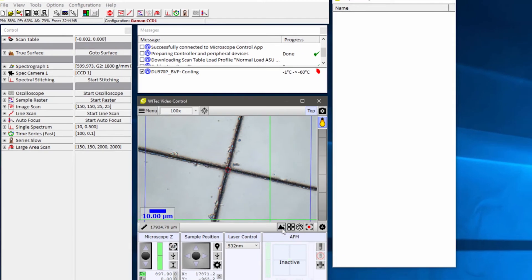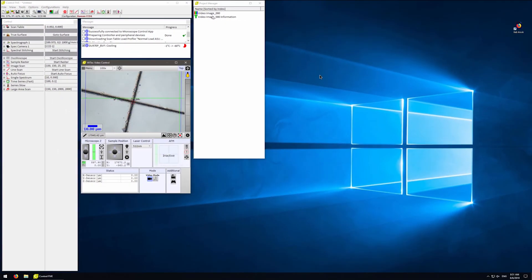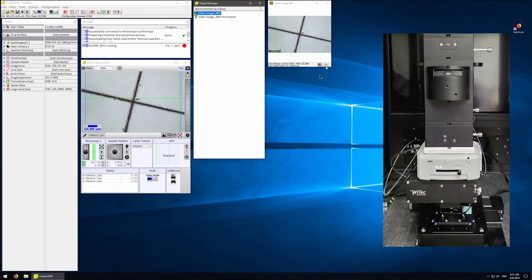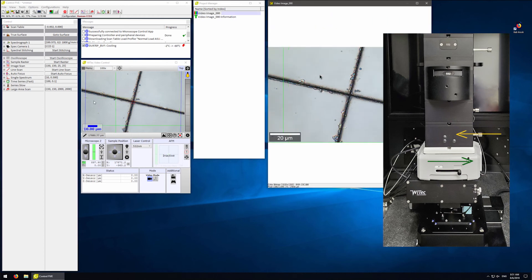Click the Monitor icon to acquire the video image. Now that we have the video image, we can set up the system for Raman measurements.